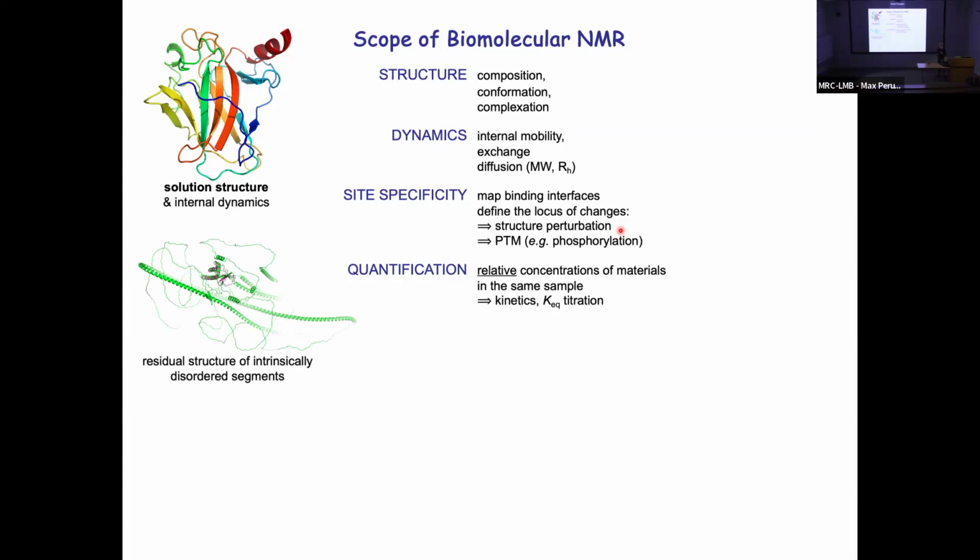So NMR is extremely slow compared with other structure determination techniques. If you have a protein, you want to know the structure, always, if the structure will crystallize, your best bet is to crystallize the sample and get the structure that way. It's really quick, in the order of hours or a couple of days, maybe, in most practical cases. In NMR, this information might take months to generate a full formal three-dimensional structure. If the protein won't crystallize, this might be months that you're prepared to invest. But in most cases, if you can get it by crystallography, you opt for crystallography first.